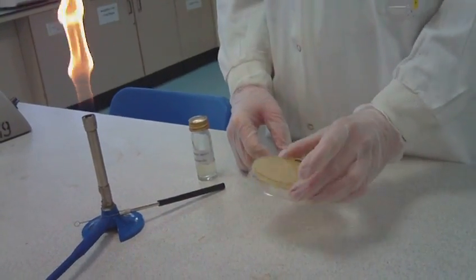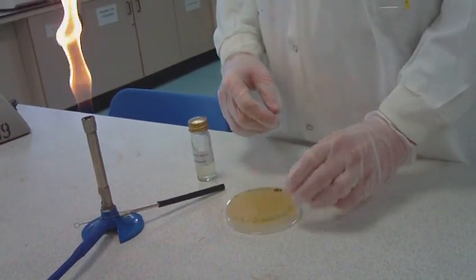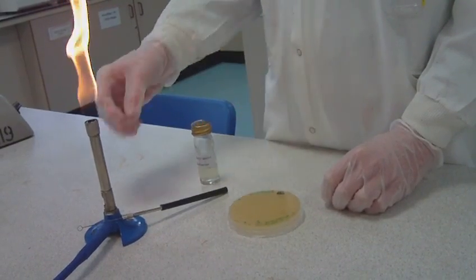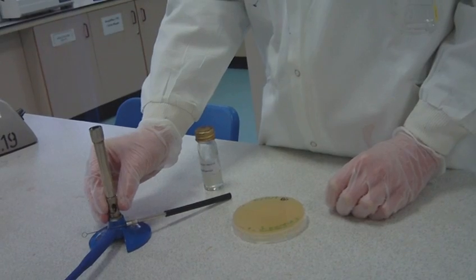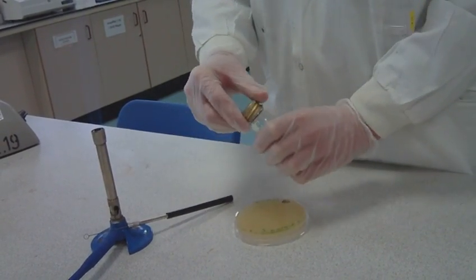Place the inverted plate close to the Bunsen burner to reduce chances of contamination. Turn on the Bunsen burner. Loosen the cap of the bottle containing the inoculum.